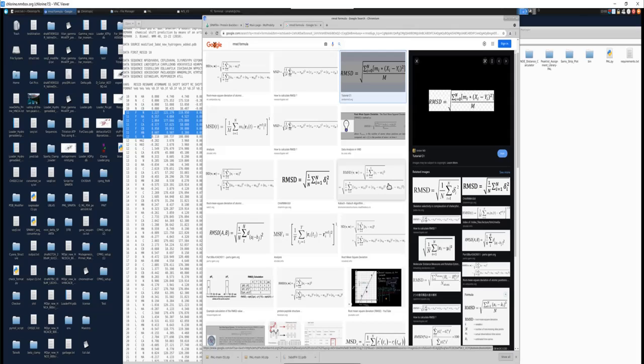Effectively, what you're looking at here is calculating the distance between two points. So for your nitrogen, x_i would be your SPARTA predicted chemical shift for the nitrogen. y would be the experimental, so from your NHSQC, what you're seeing. Then you square that.